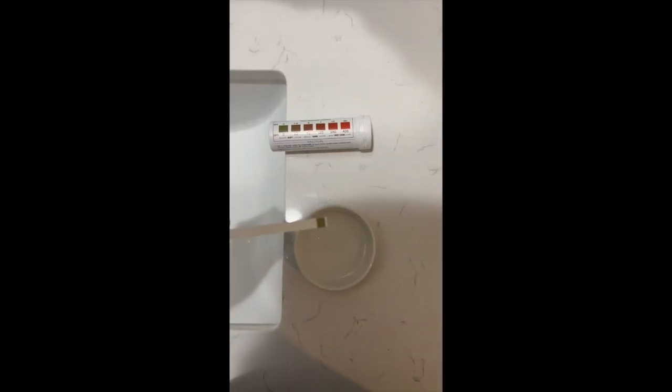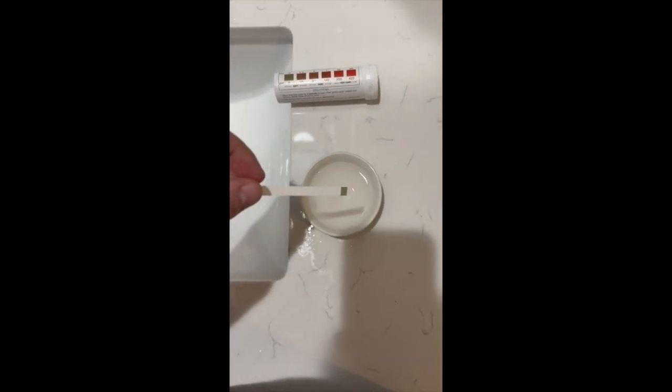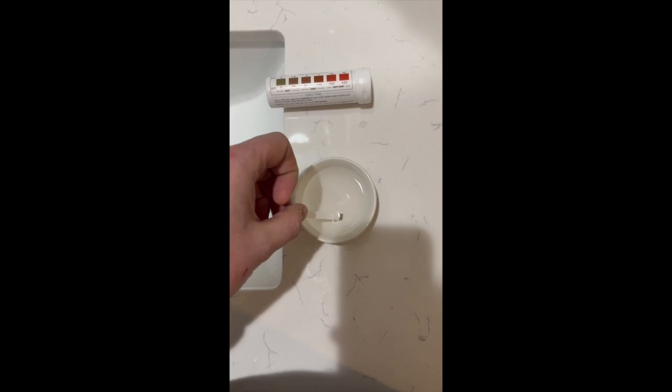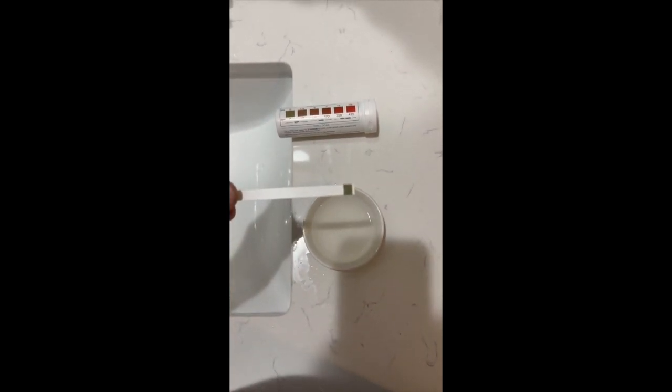All right, so we've got the water softener installed. I filled this up just here after we've got it installed. 1, 2. We'll wait 30 seconds.